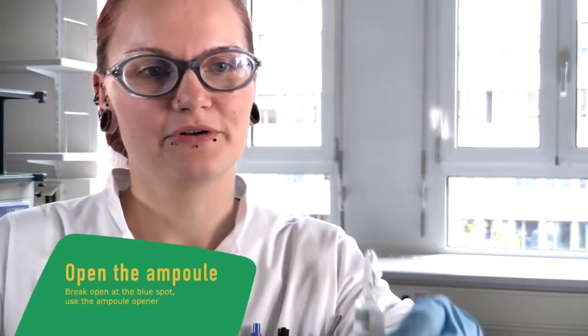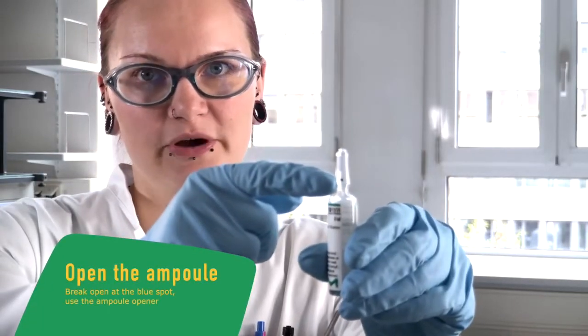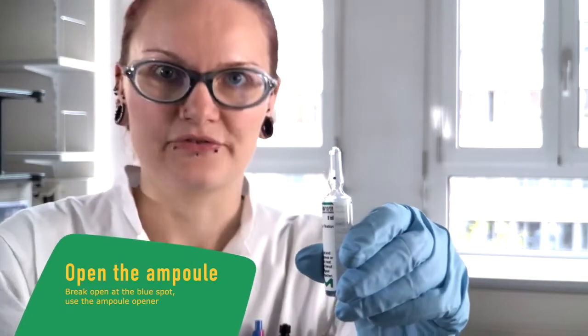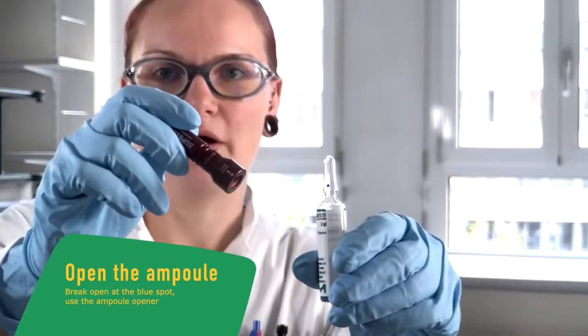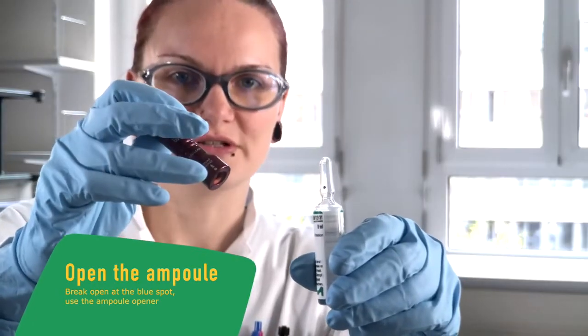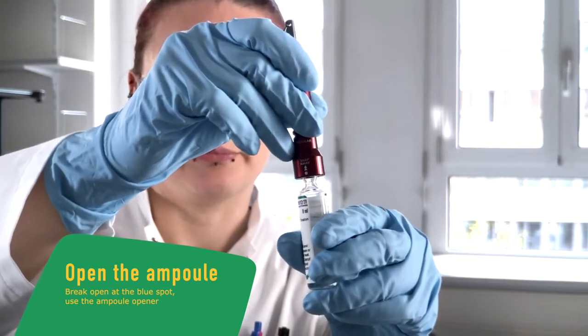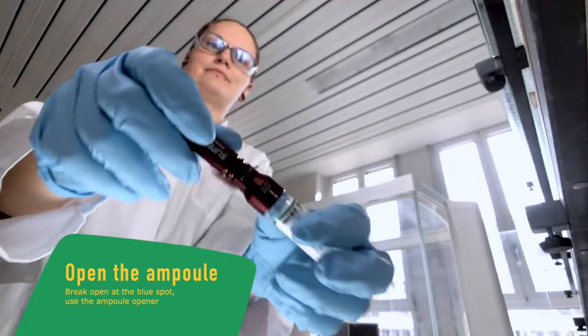To open the ampoule we have to find the blue spot and then break it away from the blue spot. And for our safety we apply an ampoule opener, which also has a spot on it, which we apply on the blue spot on the ampoule. And then we're going to break it.